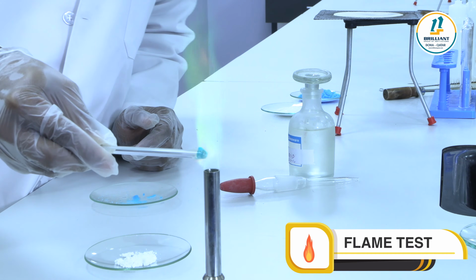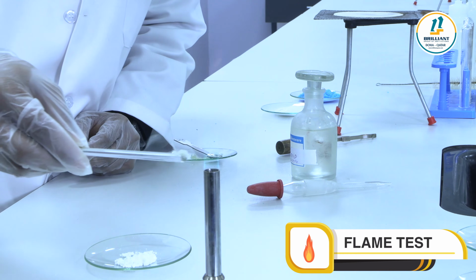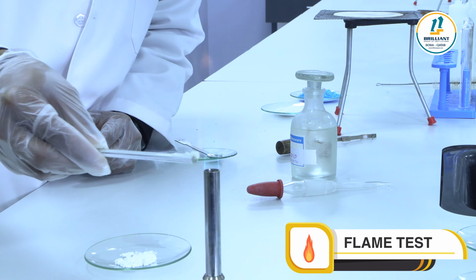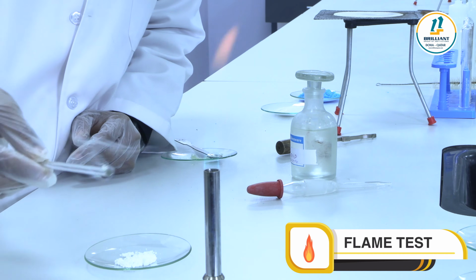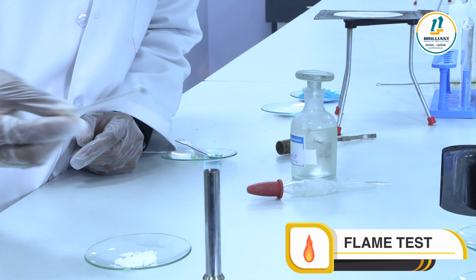Carefully observe, all of you. It's bluish green in color. Let's see what is the color of barium. Barium will glow with a pale green color, pale or apple green. That's the flame which indicates barium.